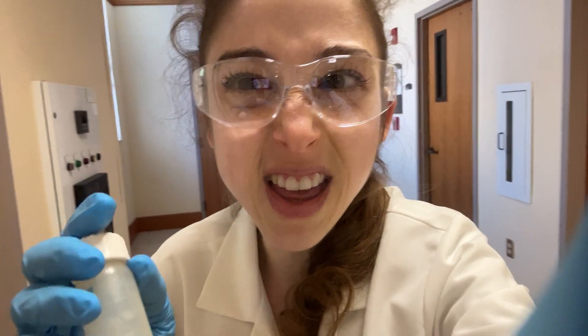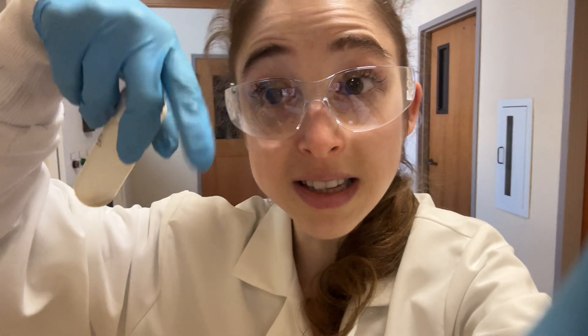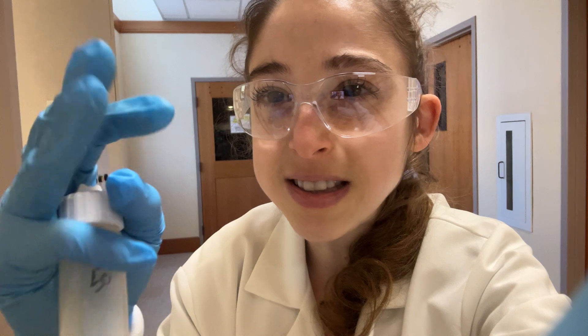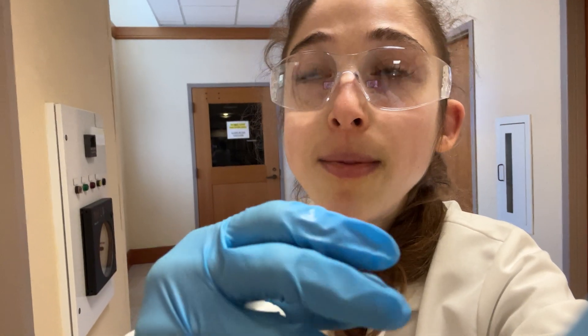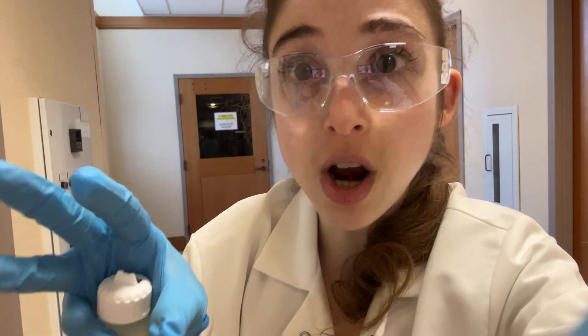We also did the enzymatic stuff and then stuck it in a sonicator. It has this probe that sets off ultrasonic waves - like how you clean jewelry with ultrasonic cleaners, except more powerful. As waves travel through the liquid, you get areas of high pressure and low pressure. In the low-pressure areas, air bubbles form, and when the high pressure hits, those bubbles burst, sending out little shock waves. This process is called gaseous cavitation, and it helps with breaking up and shearing the DNA.